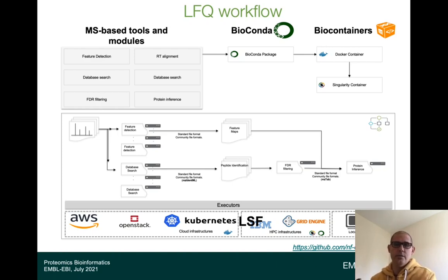When you're analyzing on multiple machines, all of them can be distributed, and in a matter of minutes you will receive a message: okay, a new machine needs to be allocated for this particular file only. And then you can reallocate that particular data analysis to a bigger machine and get back the results.